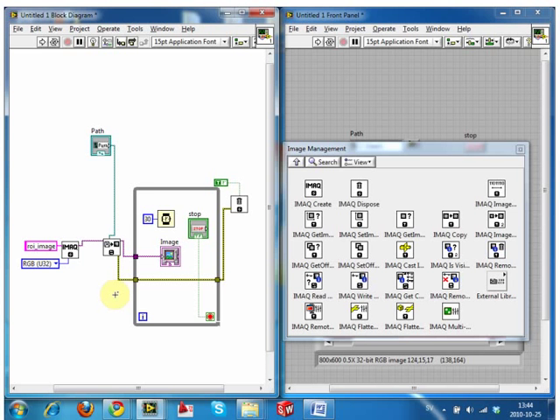A lot of these things are just, because it is still a programming language, we have to tell it to separate sections of memory for certain things. Like if we're expecting to make some numbers, we have to say, make space for some numbers because we're going to get some numbers. If we're going to expect an error.